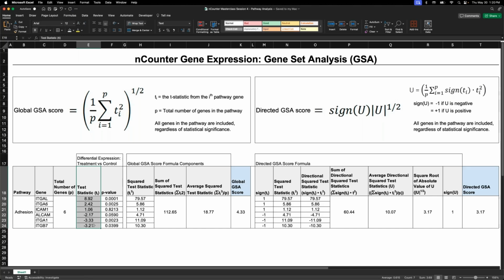Now, an important thing here is that this test statistic is going to be used to calculate our score. But if you don't know what this means, it's really hard to interpret the score. So let me provide a little guidance here. This is not necessarily true from a statistical or mathematical point of view, but conceptually, the way I think about this test statistic, it's basically kind of a summation of the fold change of a gene. Again, this is not a direct translation, but conceptually, I like to think about this number as how much fold change there is in a particular gene.